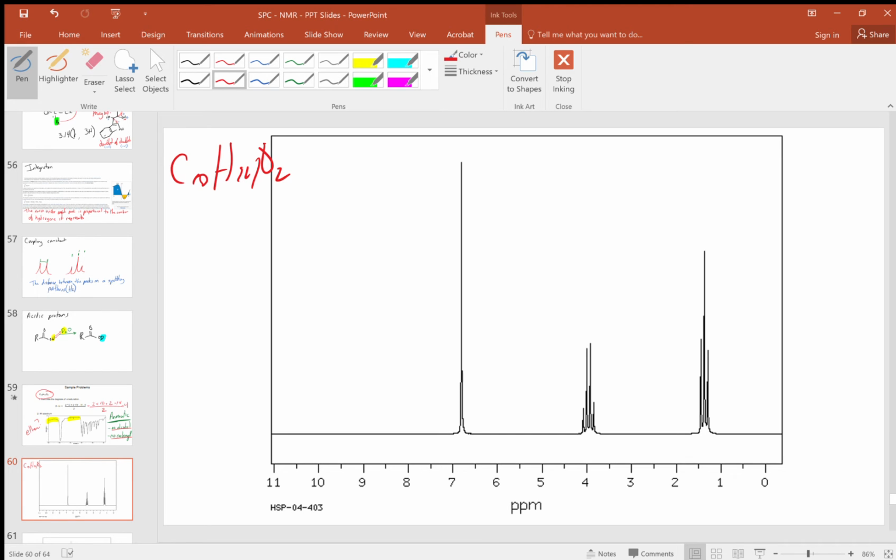Well, I know what it suggests to me is that our molecule is probably symmetrical. Now, what other information do we get? Well, the first thing is this peak right here around 7. That's right within the aromatic region. So our thoughts that we had an aromatic based on the degrees of unsaturation looks like it was pretty accurate.